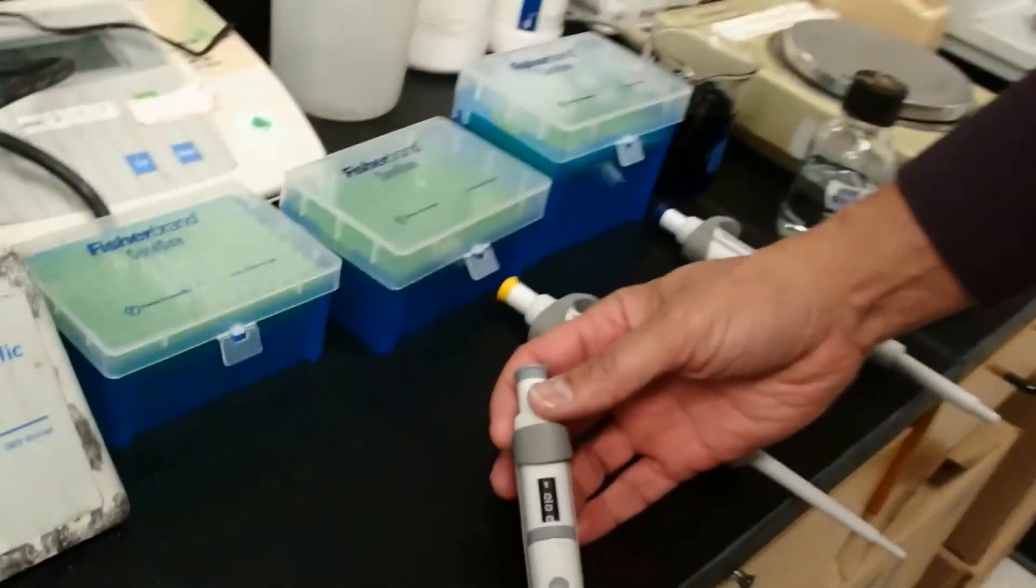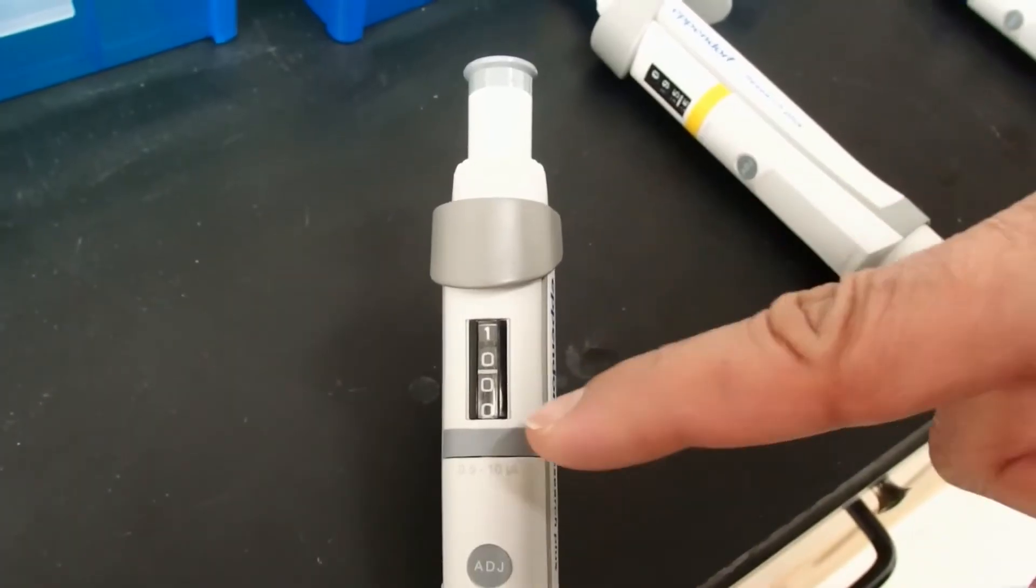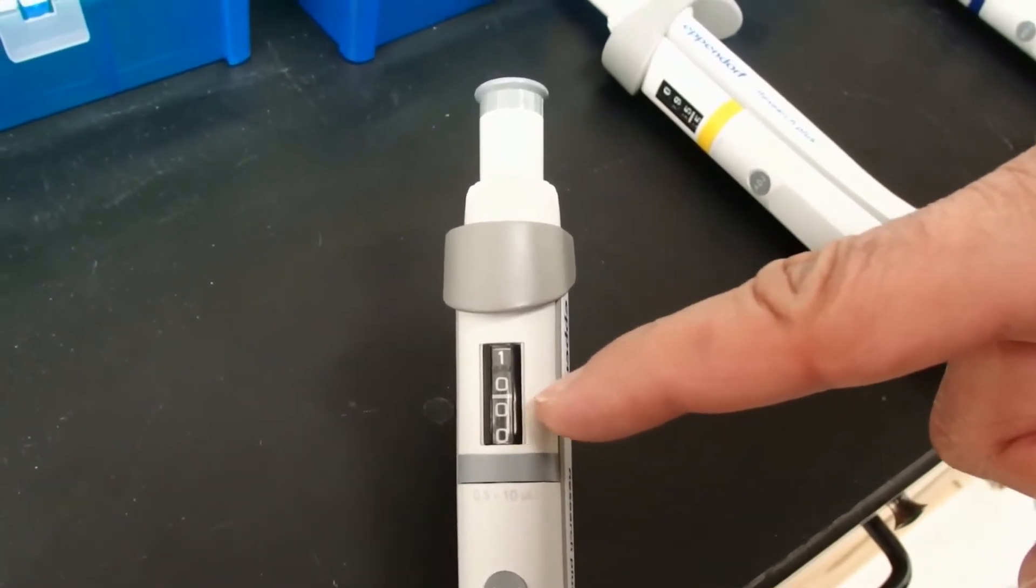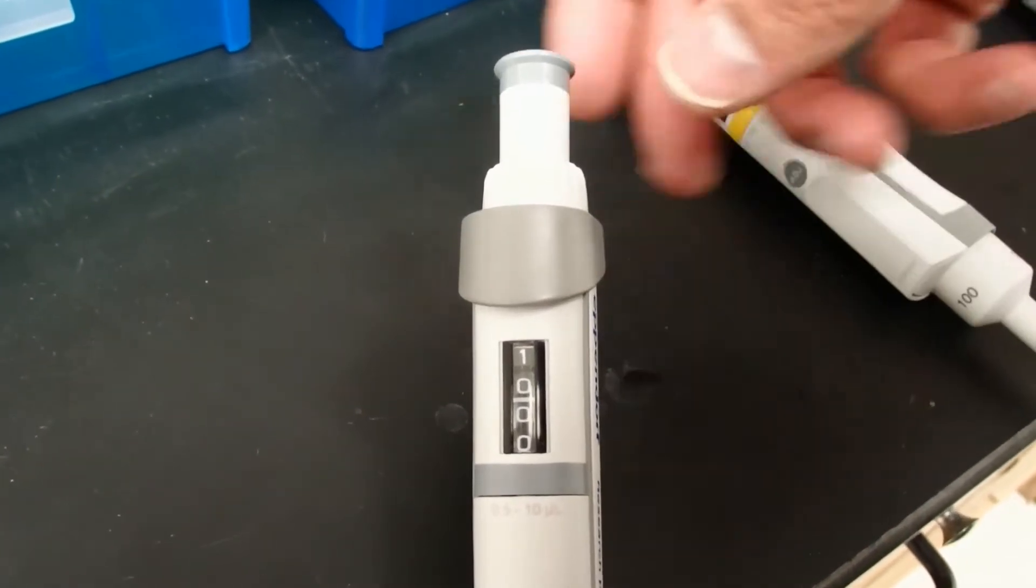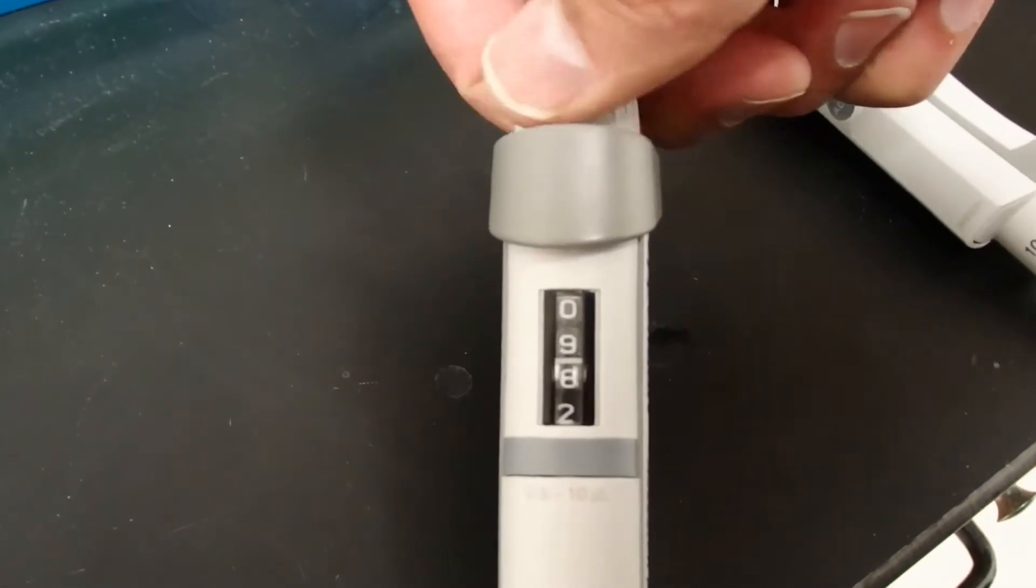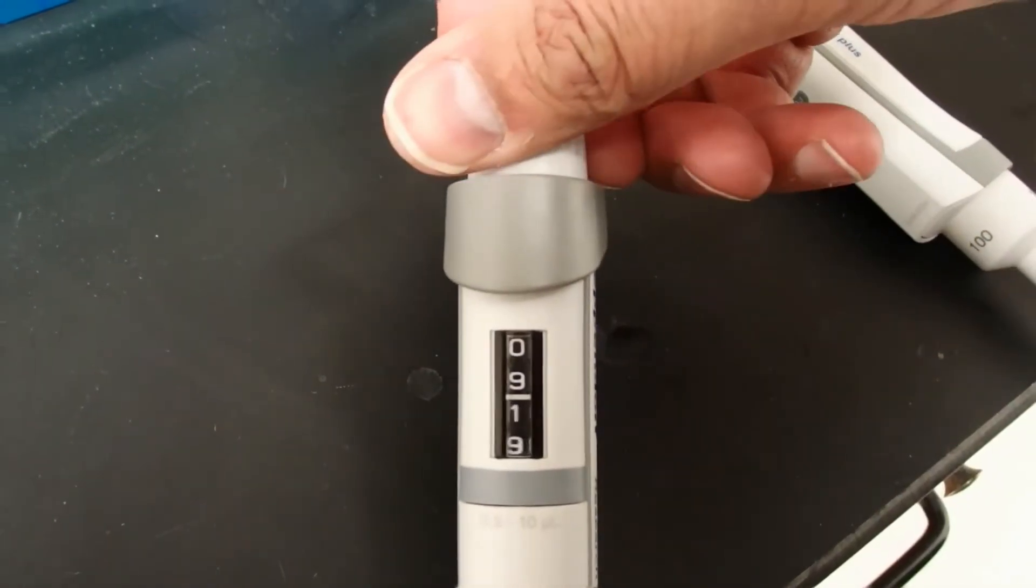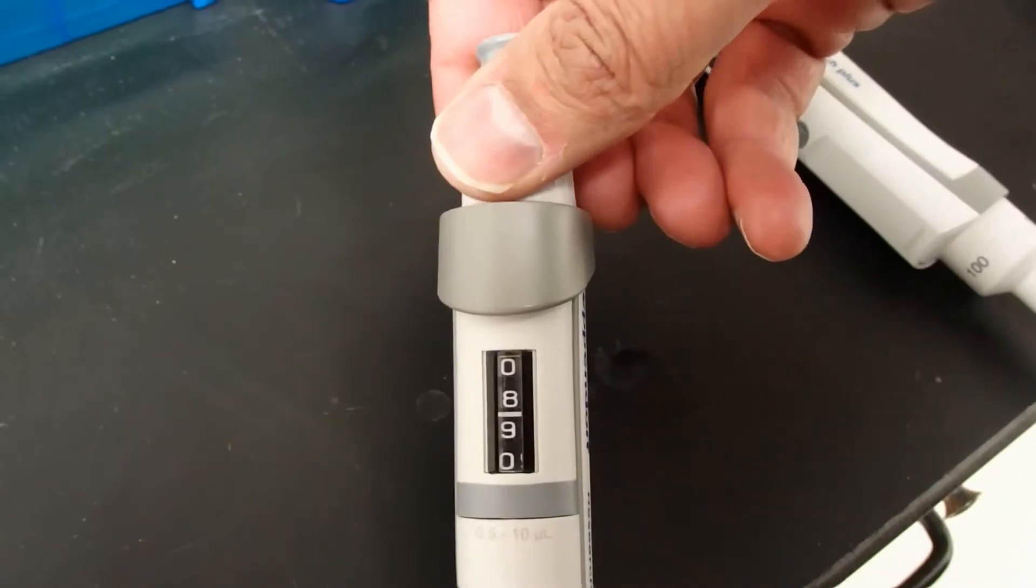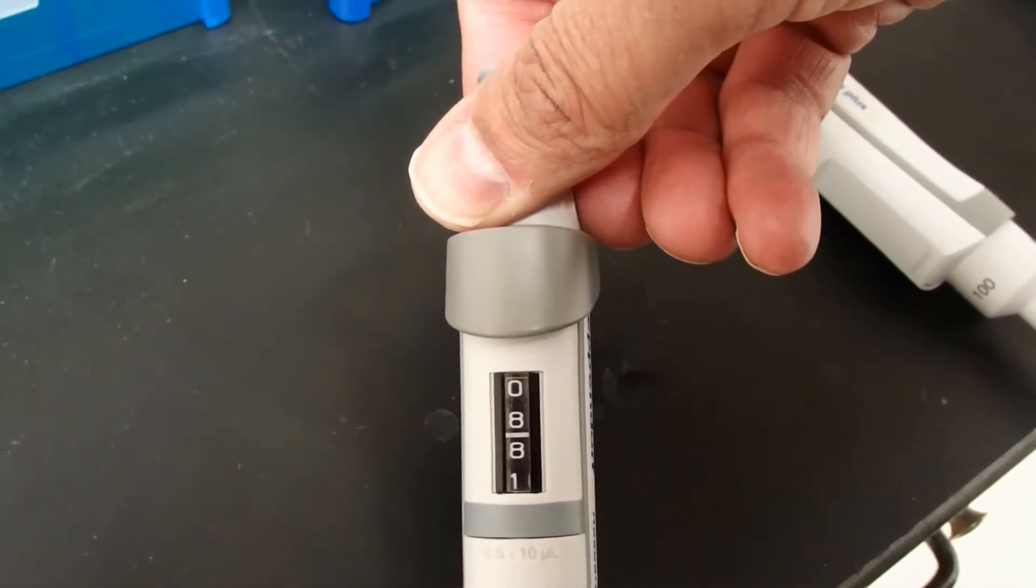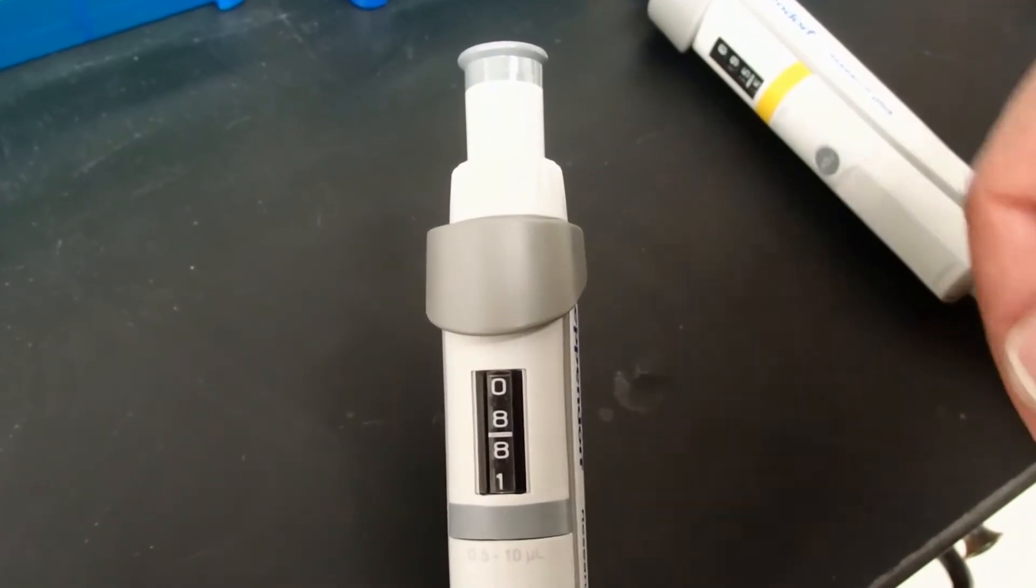The P10 has a range between 0.5 and 10 microliters. You can see the line here, which is the decimal point, is in the middle. So this reads 10.00 microliters. We could change that to whatever we want as long as we stay in the range. I'm going to put this at 8.81 microliters.